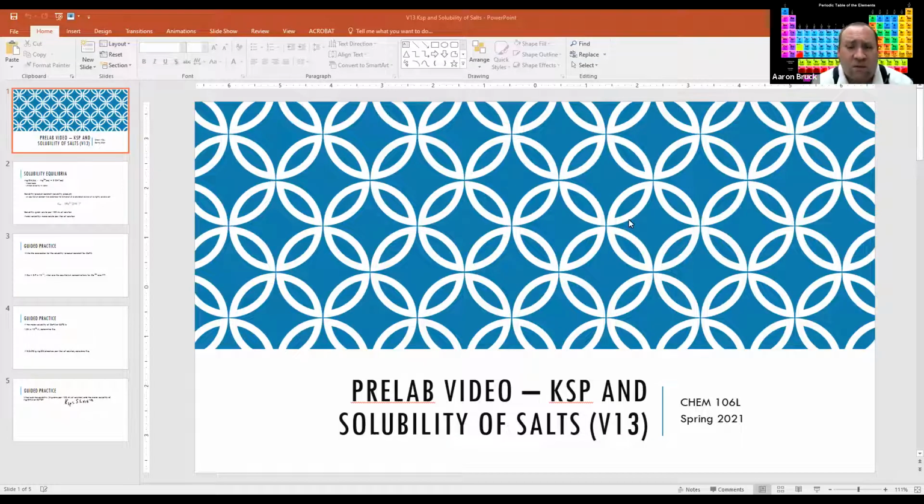Hello and welcome to this pre-lab video for lab V13. This is a virtual lab for our week 12. It is on KSP, the solubility product constant, and the solubility of salts.